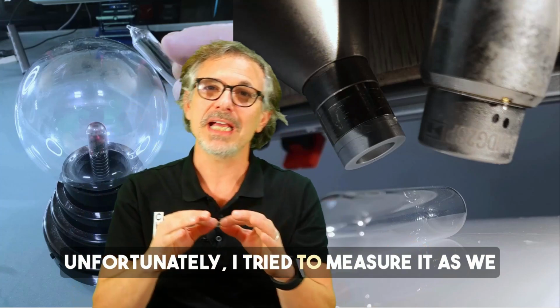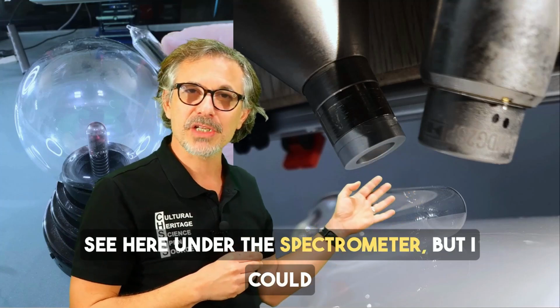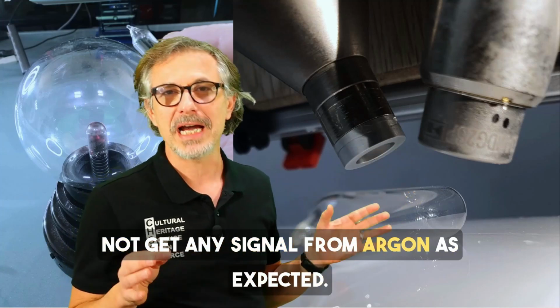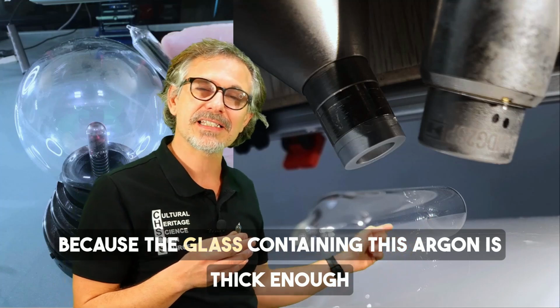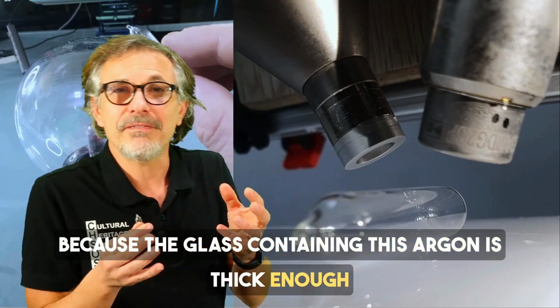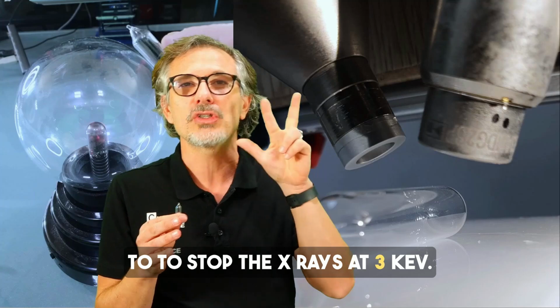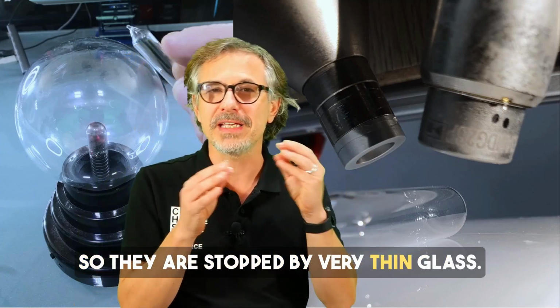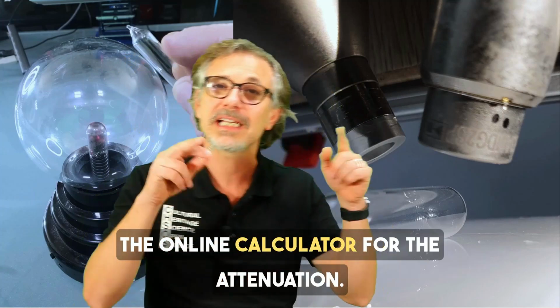Unfortunately, I tried to measure it under the spectrometer, but I could not get any signal from argon, as expected, because the glass containing the argon is thick enough to stop the X-rays at 3 keV.